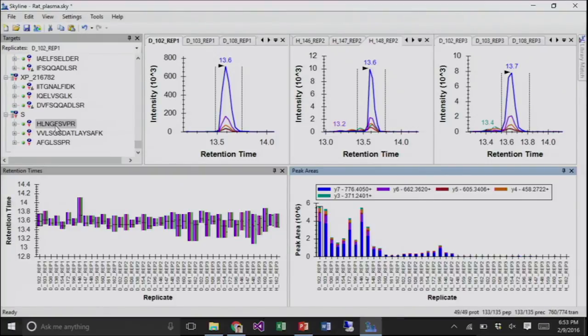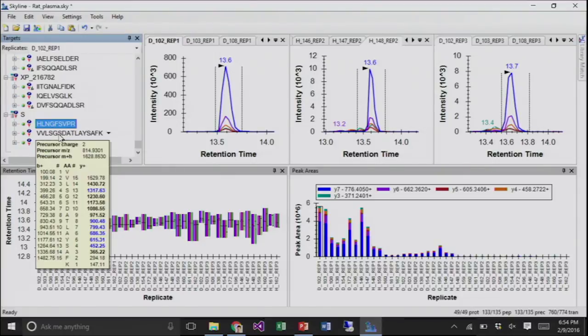I think they were chosen to have some retention time spread, but they were not necessarily the best choices. So let's look at the other ones. We want to have some global normalization peptide, especially since we can see that there's some systematic decline. It would be great to have something showing a nice systematic decline that we could normalize everything to, because we think that's what's happening with a lot of our peptides.